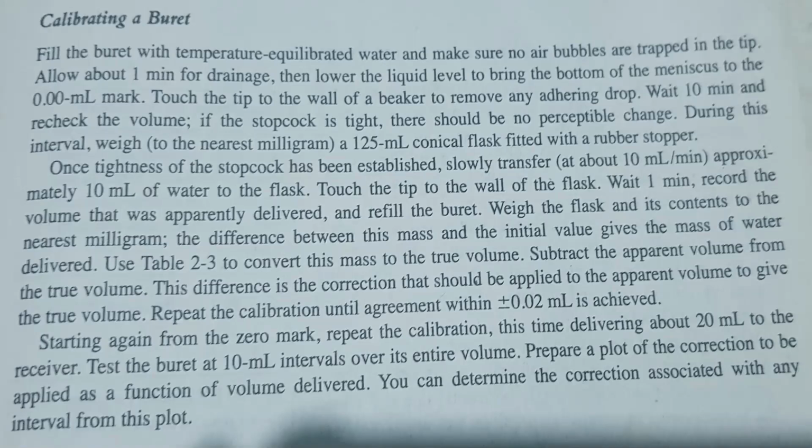And then the flask, our receiving vessel, we weigh it again. Okay? This time it contains water of approximately 10 ml. So it is the same as the burette class: the difference between the weight of the container plus the water and the weight of the empty container will be the mass of the water. That is the mass of the water. We use it to get the true volume and the difference between the true volume and the apparent volume. We use it to correct the reading of our burette.